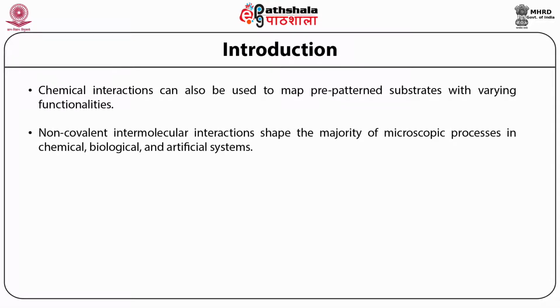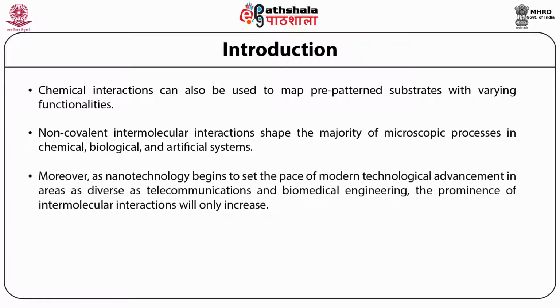Non-covalent intermolecular interactions shape the majority of microscopic processes in chemical, biological, and artificial systems. Examples range from lock and key interactions that define molecular recognition to interfacial adhesion and friction that define performance and wear of industrial equipment. Moreover, as nanotechnology begins to set the pace of modern technological advancement in areas as diverse as telecommunications and biomedical engineering, the prominence of intermolecular interactions will only increase.